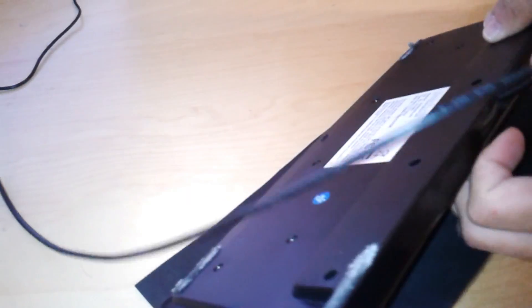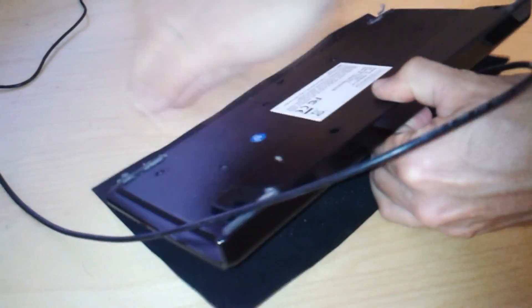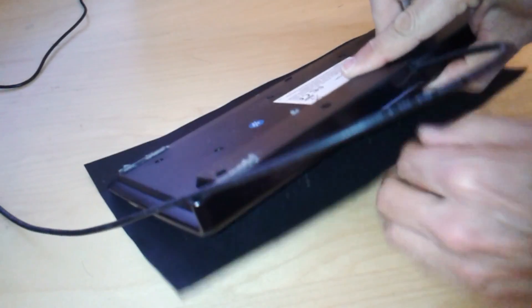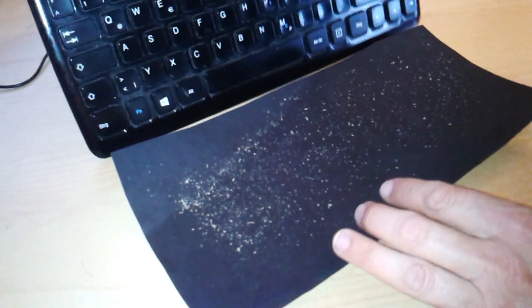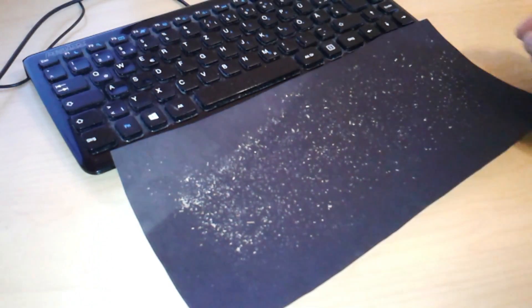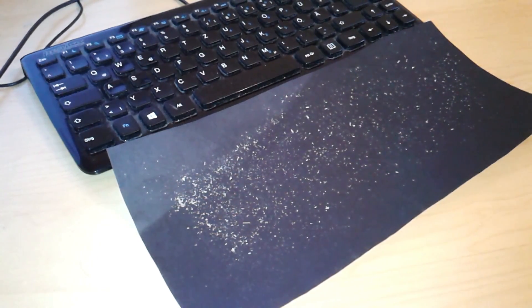Now, how can I harvest the dandruff? It's pretty self-explanatory. You just turn the keyboard upside down and give it a good knock. And here we go — that is basically our yield of dandruff. What I'm going to do is collect this together in a little pile and have a look at this under the stereo microscope first, and then later under the compound microscope in dark field.